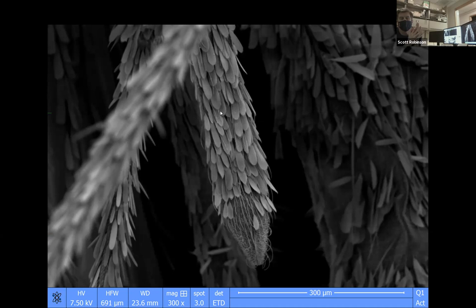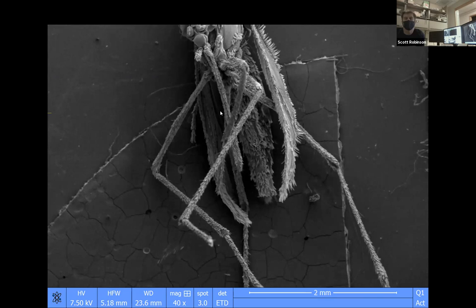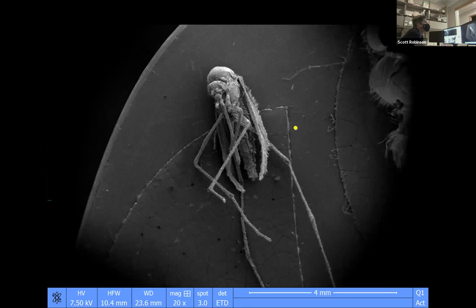You have a bundle of four stylets plus a center part that is the tube that the saliva from the mosquito comes out of and the blood goes into. And they're separate tubes, actually. It's really cool. It's really creepy. It looks like a calla lily, like a three-dimensional calla lily. And you can see where the saliva comes out and where the blood goes in. But on a male mosquito, it's kind of boring. The male mosquitoes may not eat, or they may eat nectar, but they don't drink blood. So let's go.